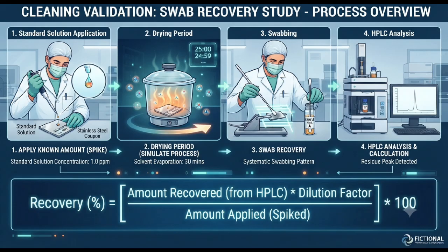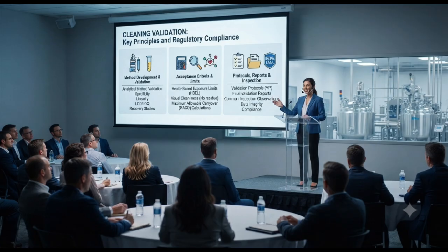The recovered amount is compared with the applied amount to calculate the recovery percentage. A consistent and scientifically justified recovery supports the reliability of the cleaning validation method.